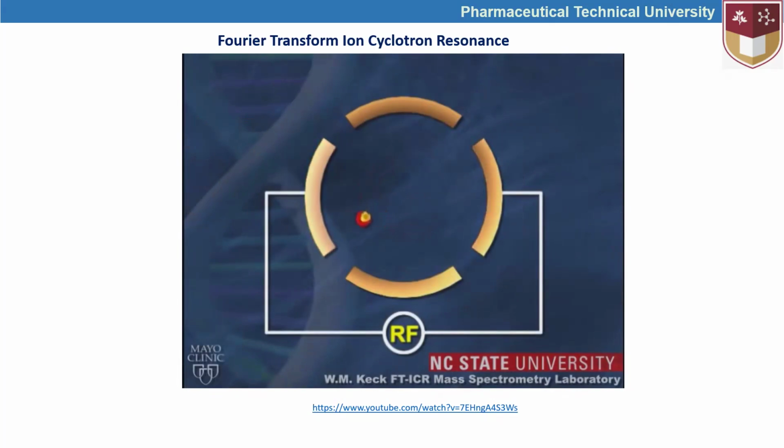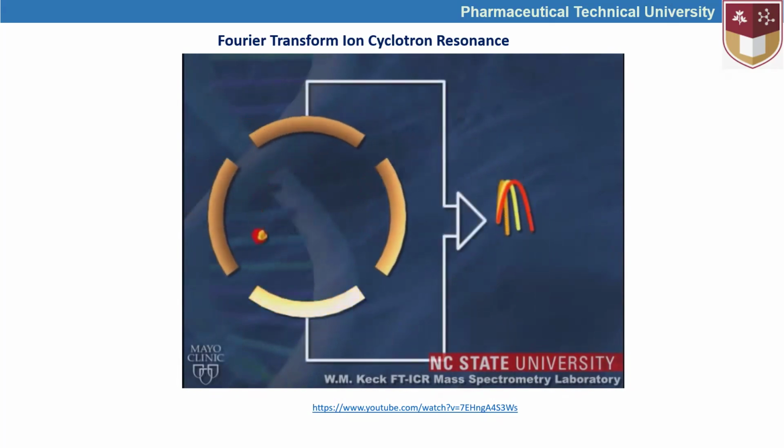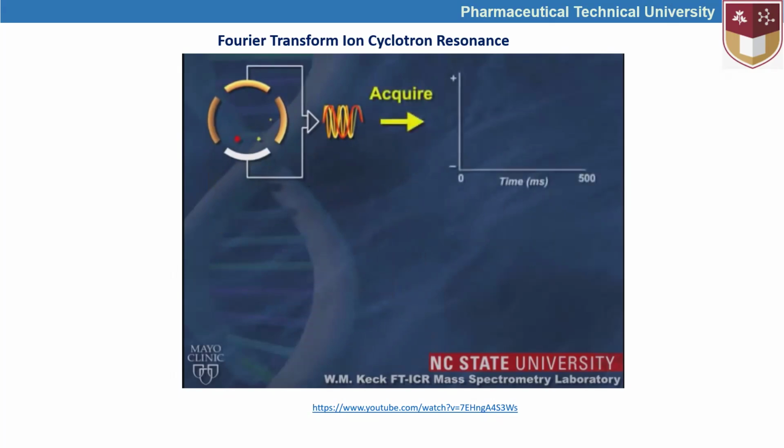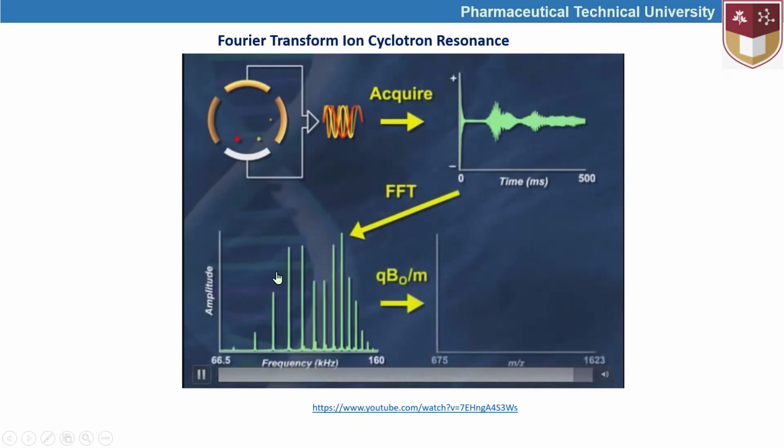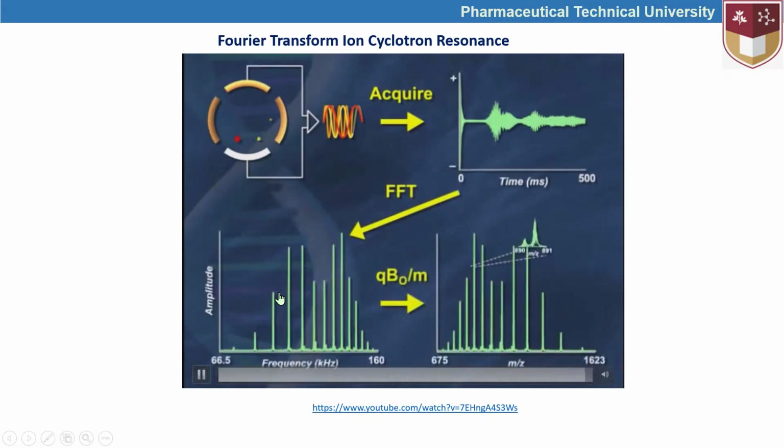These radio frequencies can give different oscillations, and resulting from different molecules, amplitude and frequency based results are obtained and converted into mass to charge results.